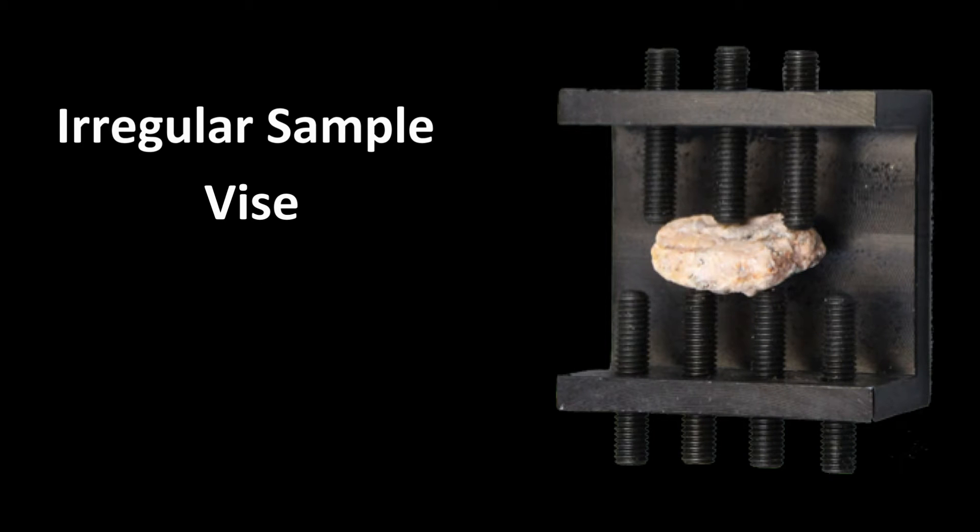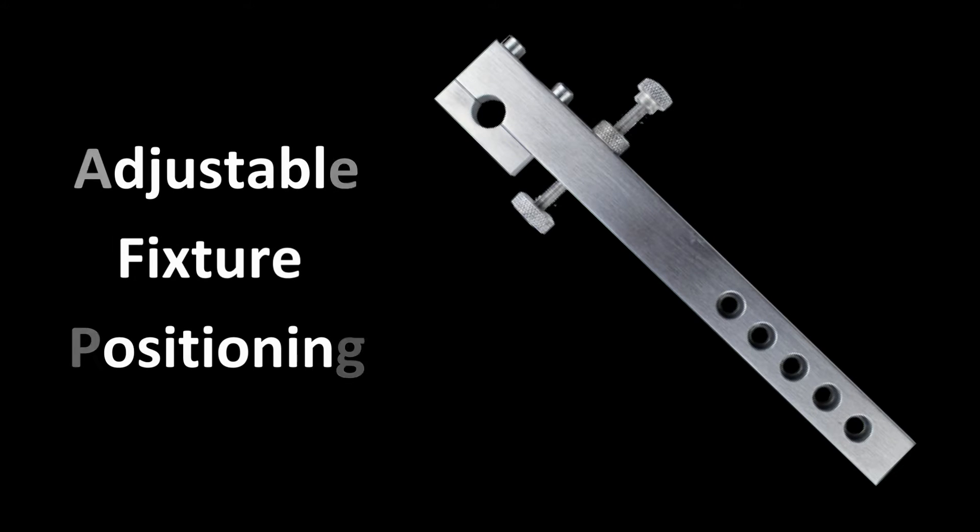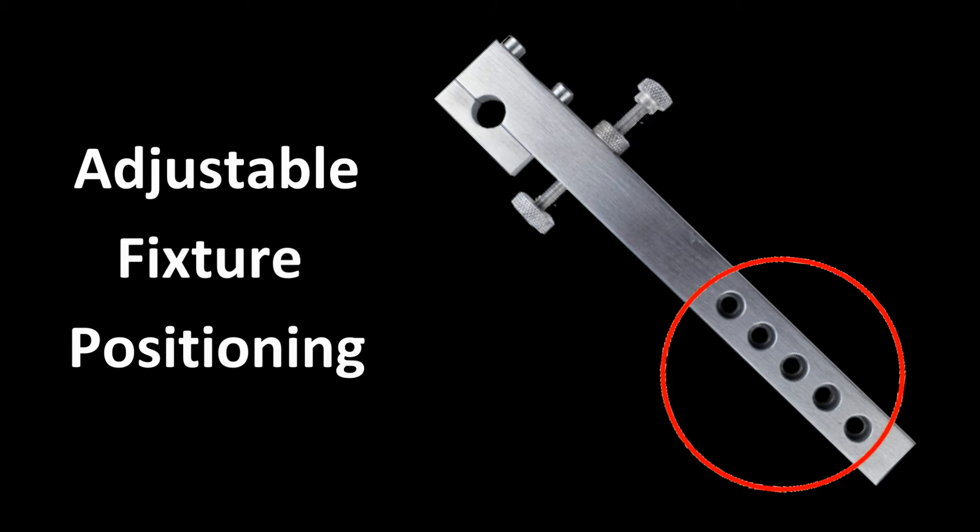The irregular sample vise is very useful for odd shaped samples such as minerals and samples with more complex geometry. The round vices are for sectioning pre-mounted specimens for more precise cutting. One of the unique advantages of the Pico 155 is that the fixturing vices can be easily adjusted to position the specimen correctly relative to the wafering blade.